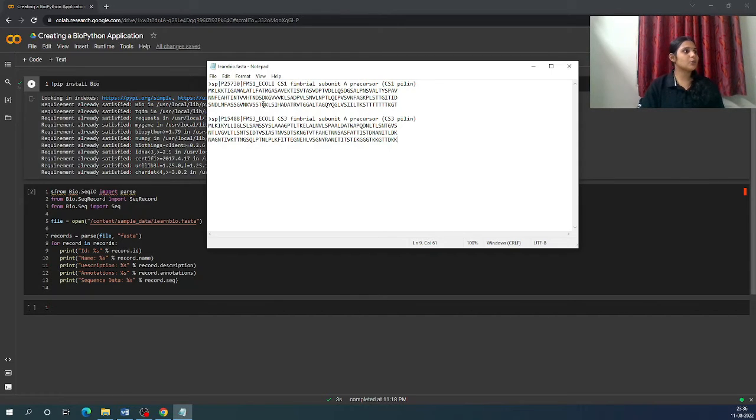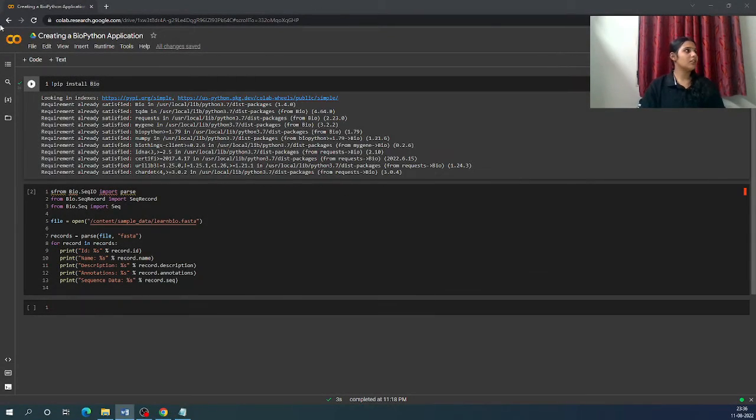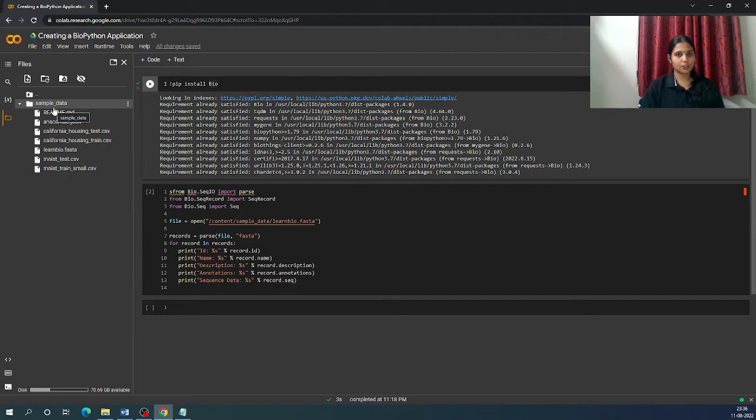Right after creating this file, we are going to upload it in our Google Colab notebook. So how do we upload it? You have three lines over here, click it. You have something called files over here, and I have a folder called sample_data. You may have whatever folder you want in your Google Colab notebook. I've uploaded my learnbio.fasta file inside the sample_data. How do we upload it? You right-click the sample_data and upload. You will have to copy the path of learnbio.fasta, whatever sequence file you're going to upload, and save it for future purposes when you retrieve it by opening it in your program.